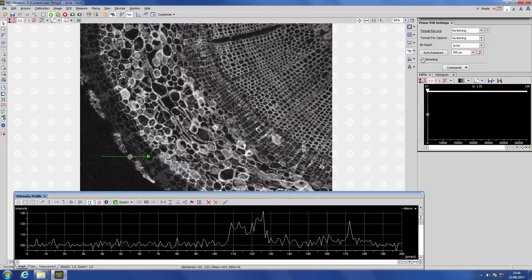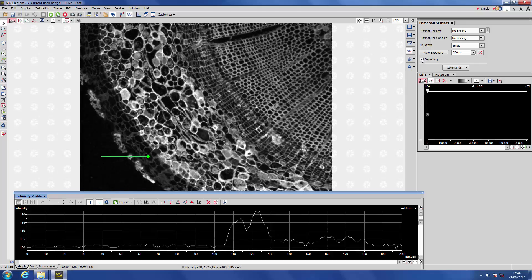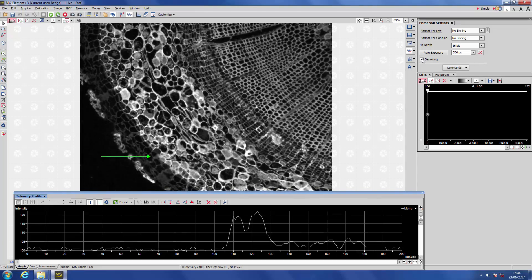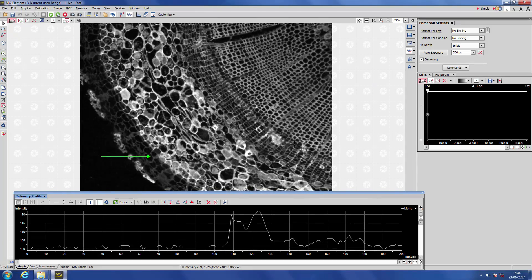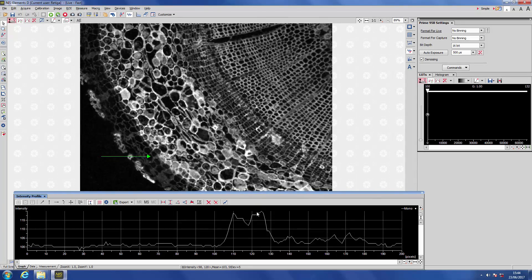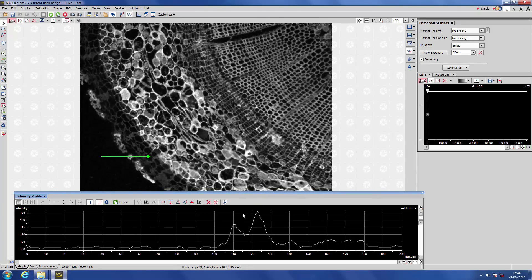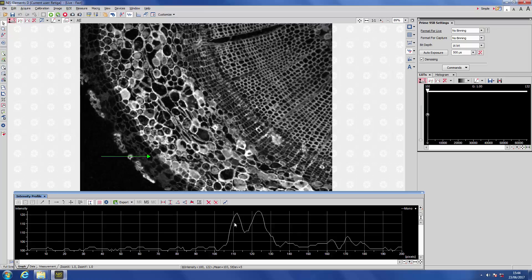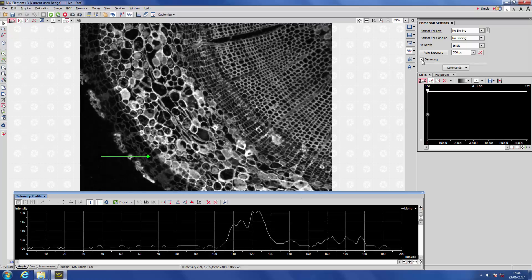So here if we turn Prime Enhanced on, you can see the level of noise is instantly reduced, but our signal values at these two peaks are preserved.